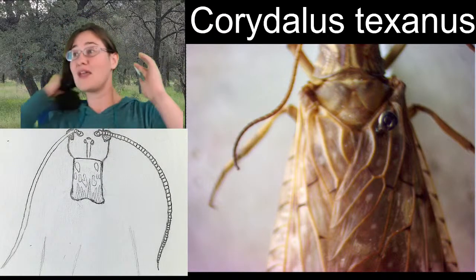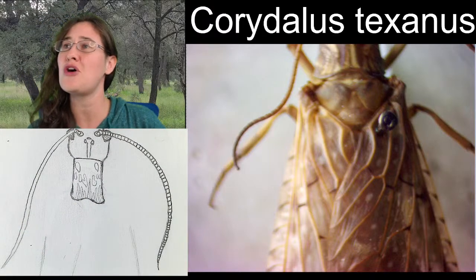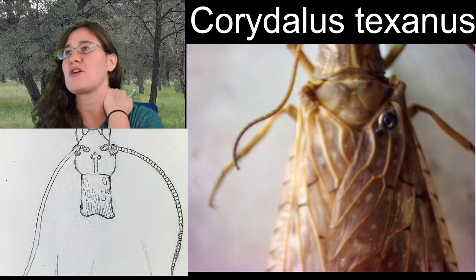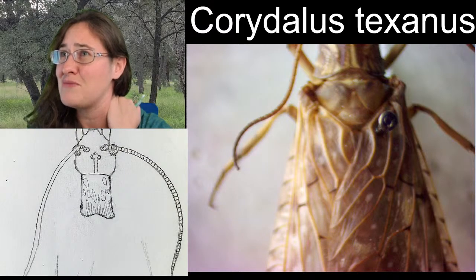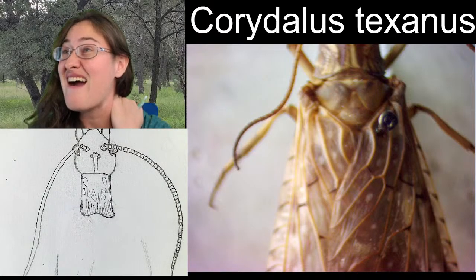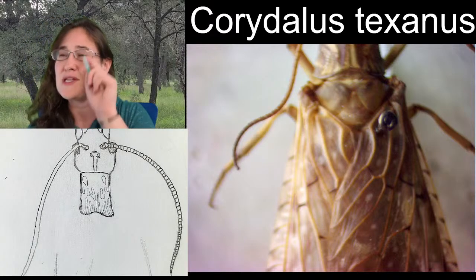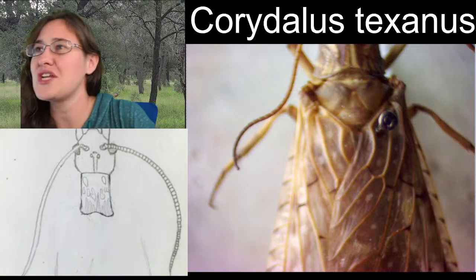All right. So let's see. We are continuing on past our pronotum. A lot of times we would consider this next section here, this little triangle that's pointing down, a scutellum. Admittedly, I'm not sure if they're called scutellums in Dobsonflies. I would think that they are, but it's possible that they don't call it that because it almost looks like there's more than one segment in there. So, we're just gonna not label it.